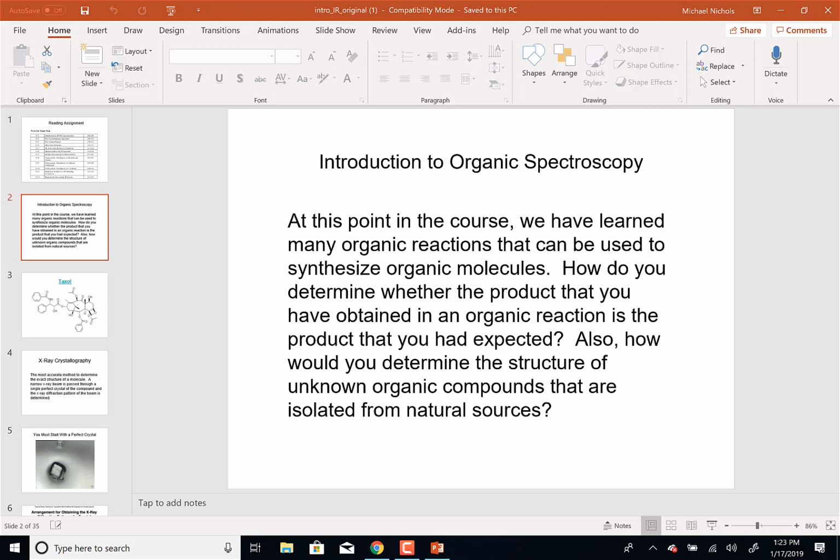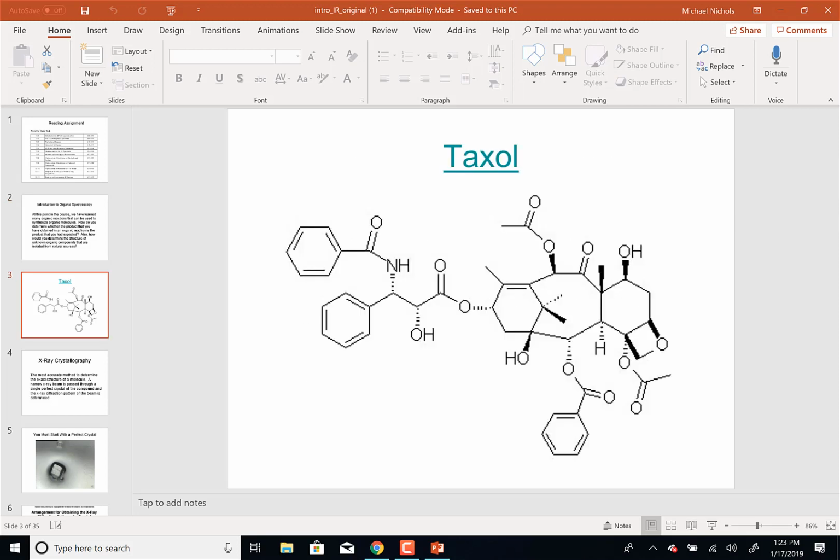And the question is, what techniques, and then we're going to talk about the techniques and also how you use them. So here is an incredibly complicated molecule called Taxol. Taxol is now routinely used to treat ovarian cancer and probably a number of others. It's got a lot of chiral centers. It's got rings bigger than 6. It has a lot of different functional groups.